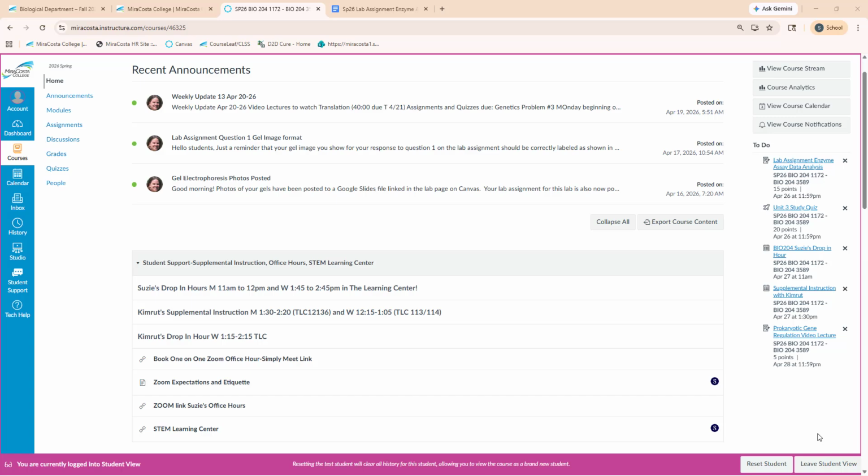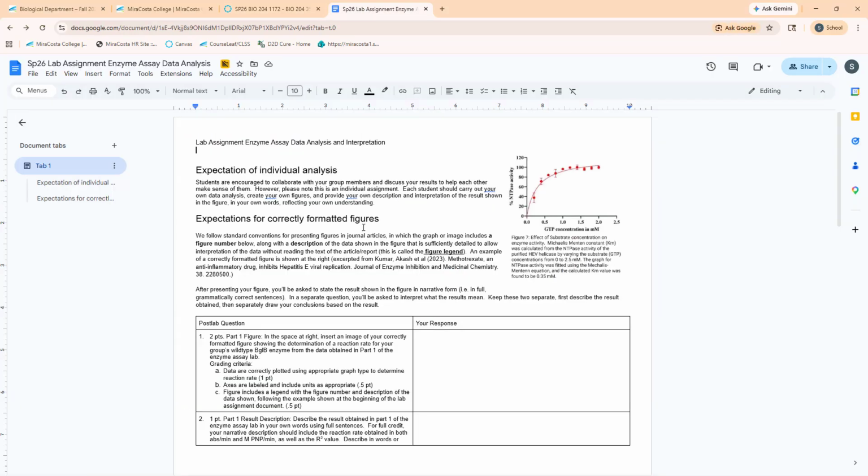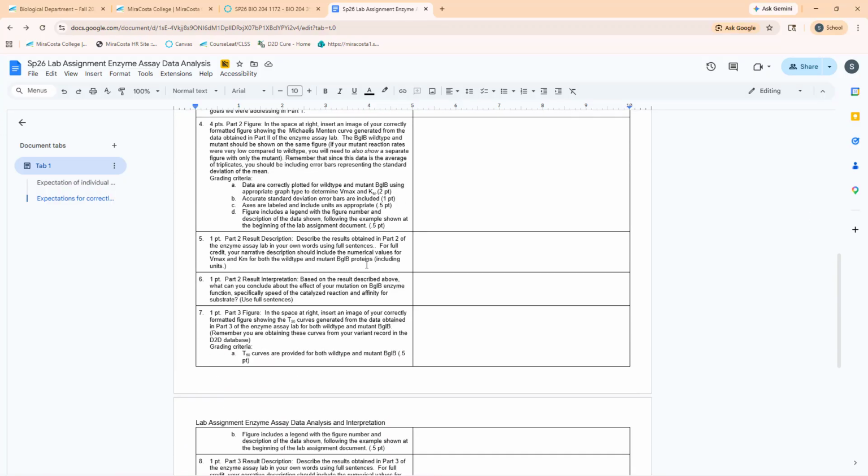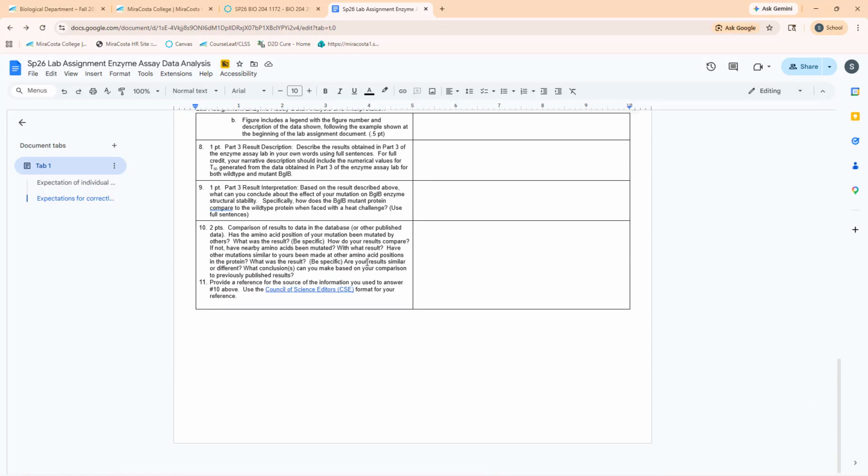I've gotten a few questions about how to find the thermostability assay results that you are asked to present and describe and interpret in your lab assignment. And so I wanted to just make a quick video to show you guys how you can access that.